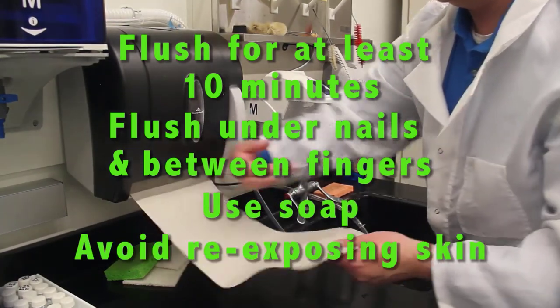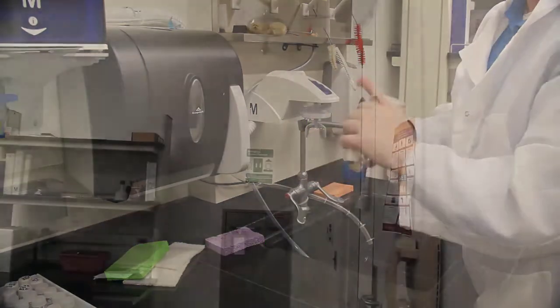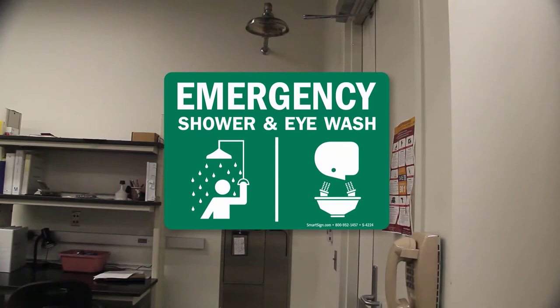Also, avoid touching any surface that may re-expose your hands to the chemical. Extreme exposure to large amounts of skin requires disrobing and flushing with water under the emergency shower.